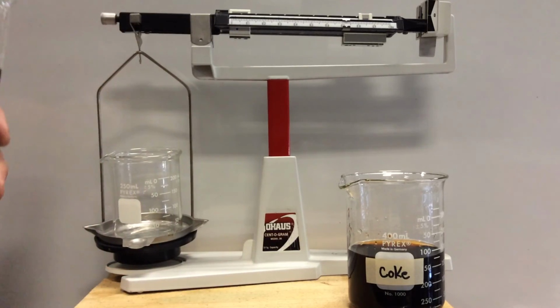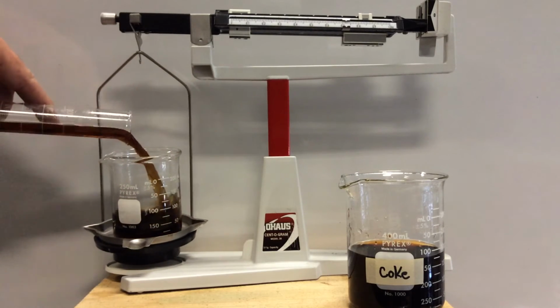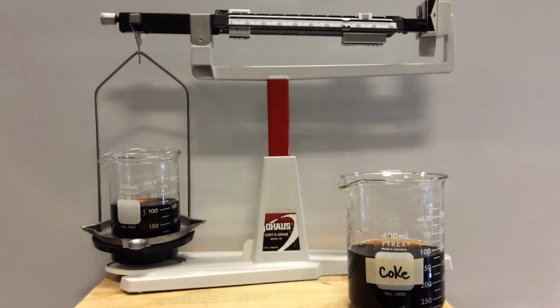So now let's pour this liquid in. You already know this mass from a previous massing out. And I'm going to pour 100.0 milliliters of regular Coke. And we're going to go find that mass.